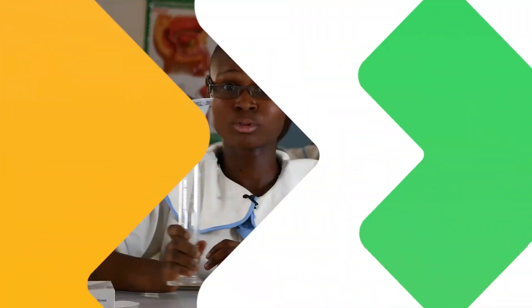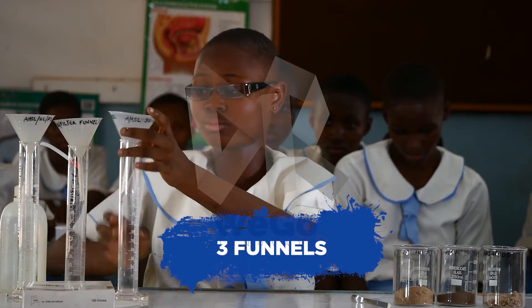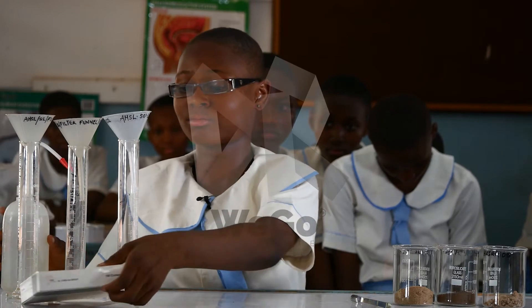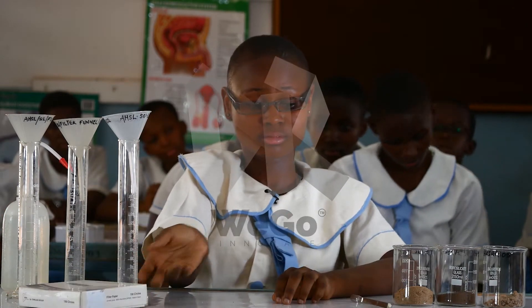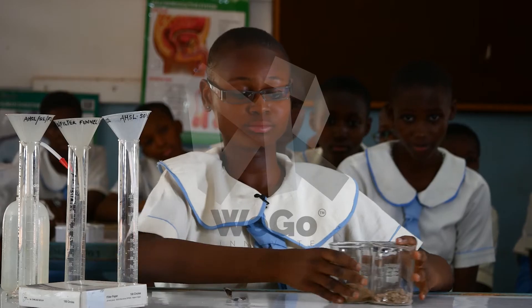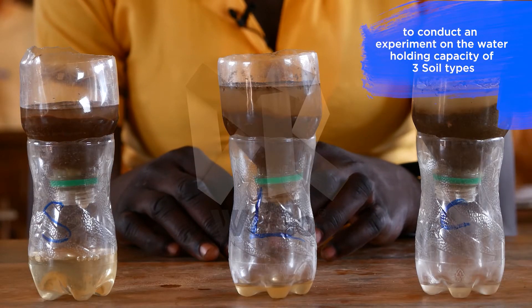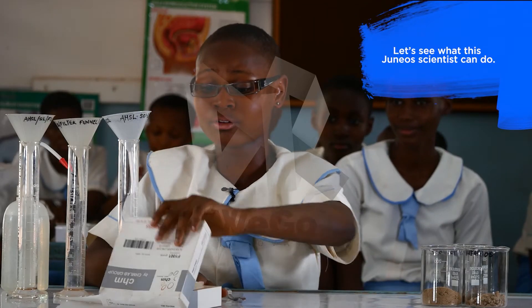Sophia will use three measuring tubes, three funnels, and a wash bottle with water, three filter papers, and three types of soil to conduct an experiment on the water-holding capacity of the three soil types. Let's see what this junior scientist can do.